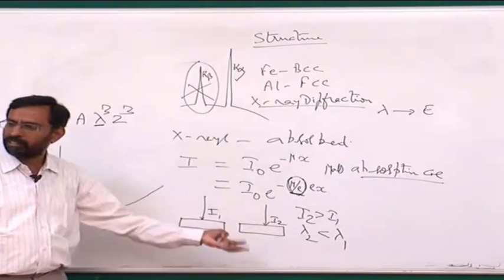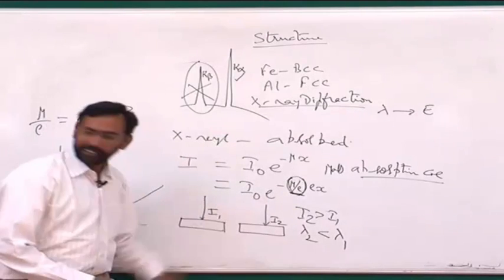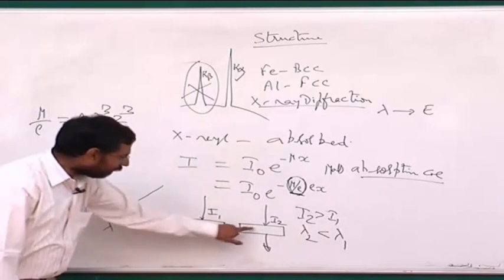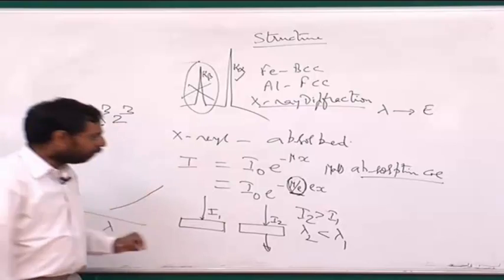If I send that, then the energy coming out for a given thickness and the same material is going to be higher.